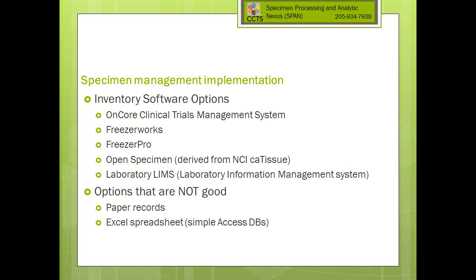That's OpenSpecimen. And then there are other options, laboratory LIMS, or laboratory information management systems. These are typically used in large core labs to manage instruments and data collection from instruments, but many of them have specimen management capabilities too.